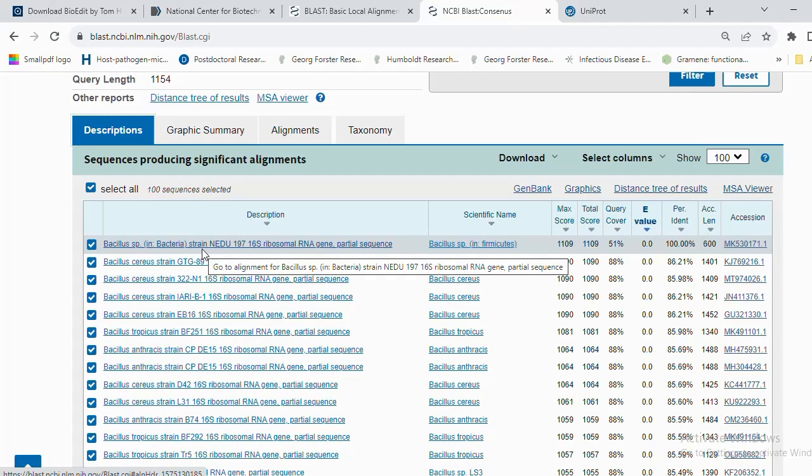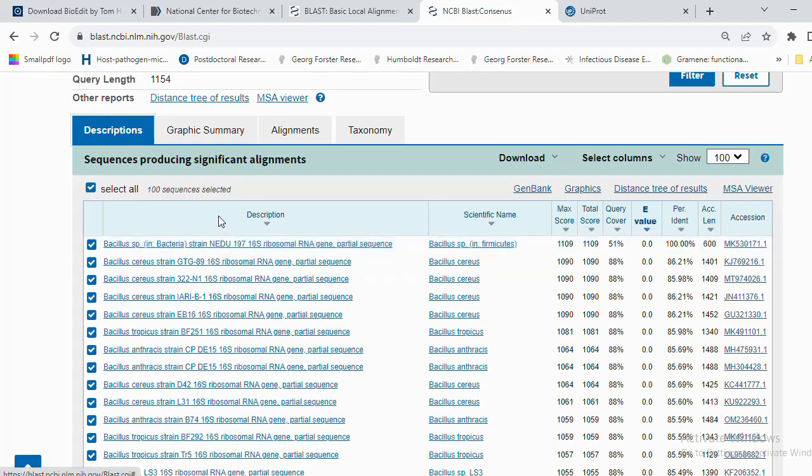Actually, that's what I used. We studied it earlier as NADU. We studied it as Bacillus species because we were very sure about this. It wasn't so specific. At times 16S may not be so specific, but it can tell you that it's a particular organism, though the certain strain it may not give you. But we were sure it was Bacillus, so we studied it as Bacillus species.